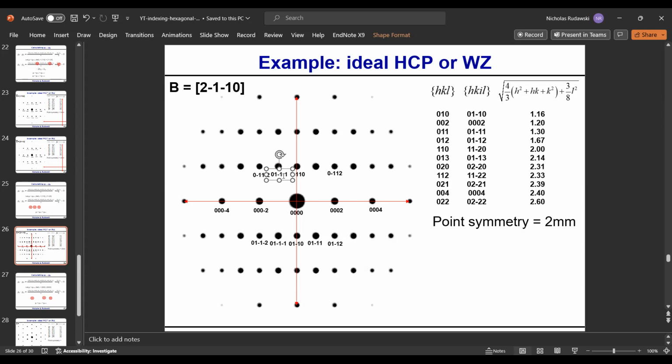Okay, so what do we have here? Let me just start with this one. That's going to be -1 right there, and then on the other side, it's going to be +1. I apologize, I know that's getting a little tight in here, but that's what happens with these. Okay, so that's the solution.